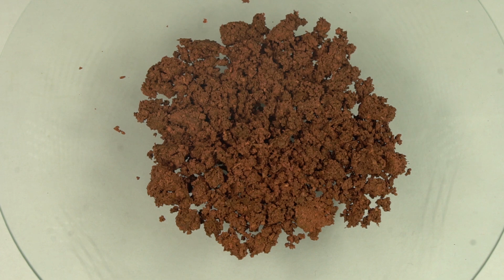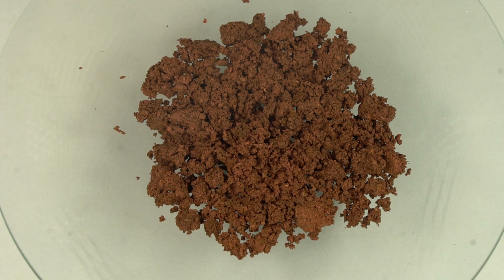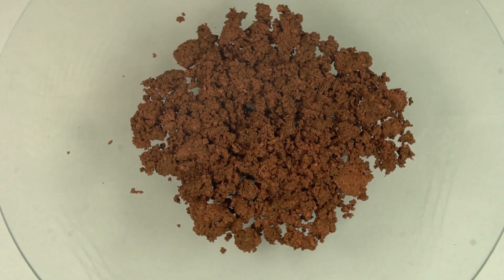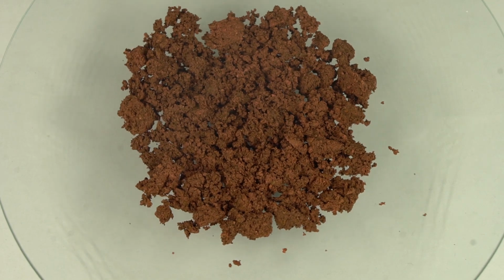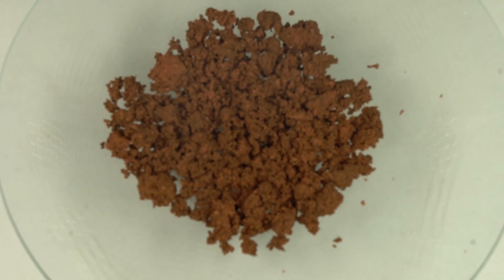We used about 50 grams of copper sulfate pentahydrate, which is 1/5 of a mole. The molar mass is about 250, so 50 over 250 is 1/5. So the atomic weight of copper is 63.55, so we should end up with about 12.7 grams of copper. That's our expected yield. I am going to weigh this, and after it dries a little bit, I just want to spin it one more time. I love doing that. This is just the most beautiful specimen of elemental copper I've made. I think our yield is going to be pretty good.